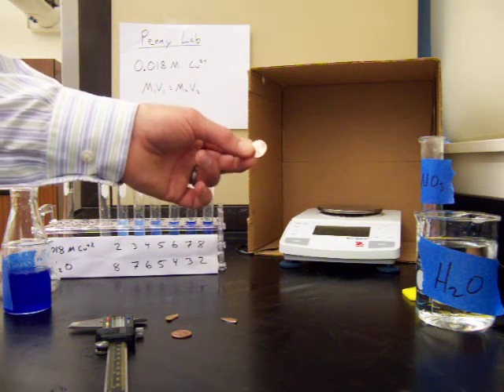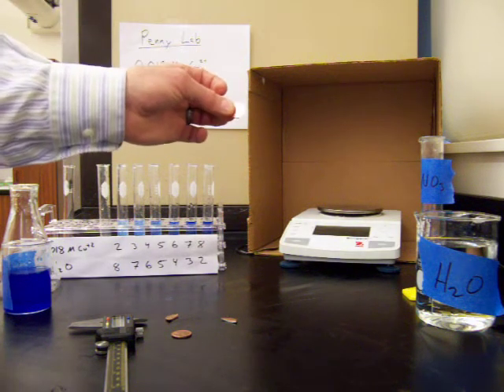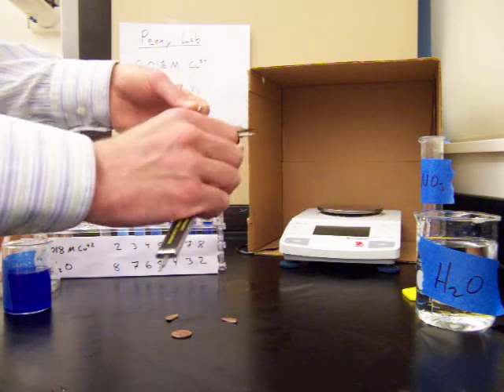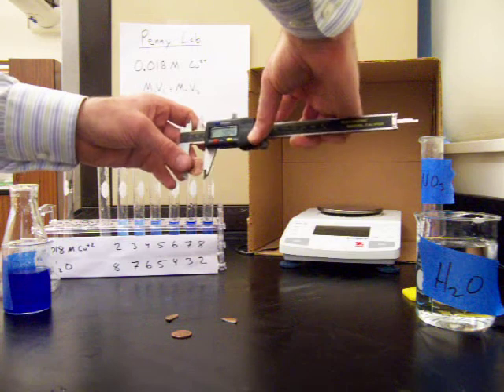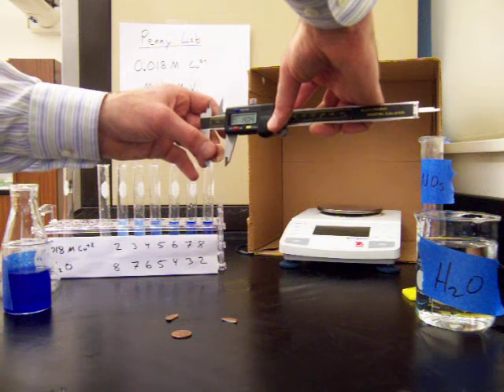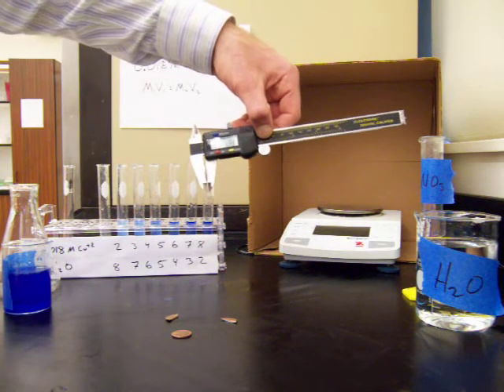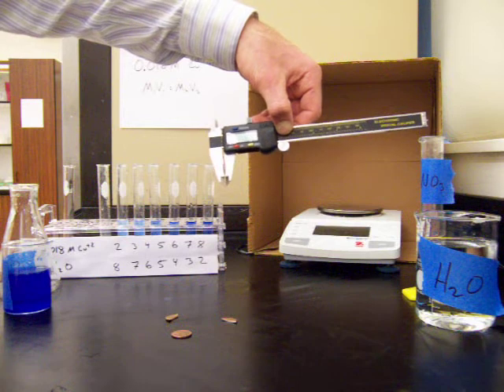We're going to work with the newer penny that has copper on the outside and zinc on the inside, and we want to determine how thick the copper is. The newer penny had a mass of 2.44 grams. We also need to find its dimensions using calipers. The diameter of the penny is 19.04 millimeters, or 1.904 centimeters. The thickness of the penny is 1.38 millimeters, or 0.138 centimeters.